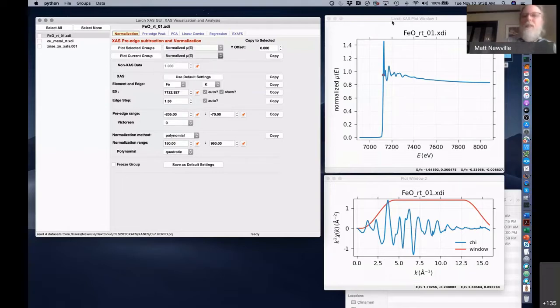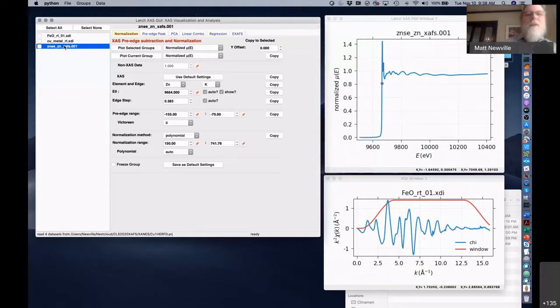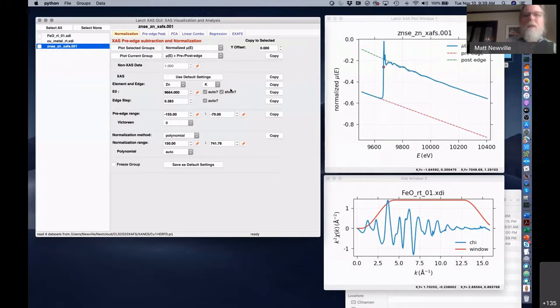Right. So the goal is to get this to look like it's sort of matching and not doing a crazy extrapolation. I don't think that any of these data sets here go crazy enough. Maybe this one could. If I made that range shorter, so let's just pretend that I had a lot less data.